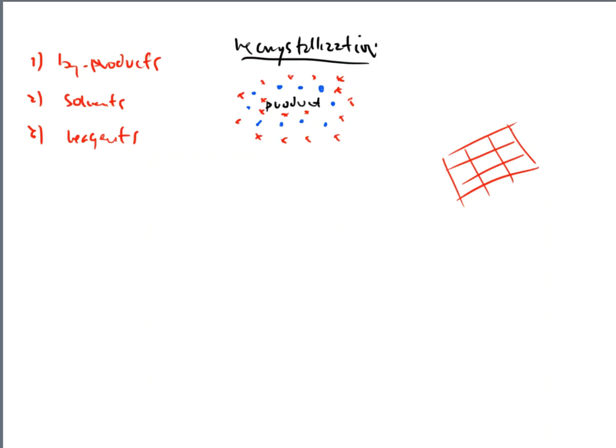So when we make this product, what I would see is a little molecule here and a little molecule there and a little molecule there. And they begin to maybe hook up with each other. And they hang out with each other. They like that. They're friends. They're buddies. Not a big deal. Not a problem. So I'm going to see a bigger and bigger crystal start to form. And it will get so big that I can see it with my eyeballs, right? And so we see that as a precipitate in the bottom of our flask or our test tubes or our beakers and so forth.